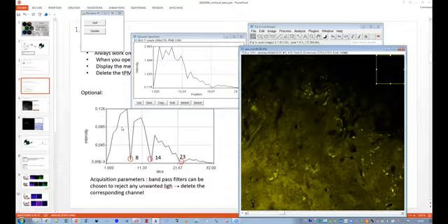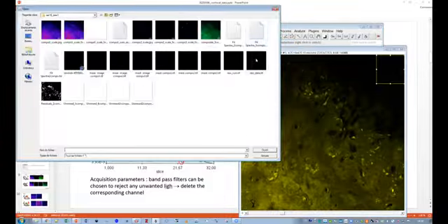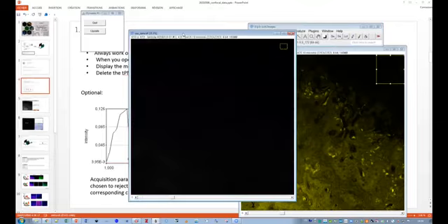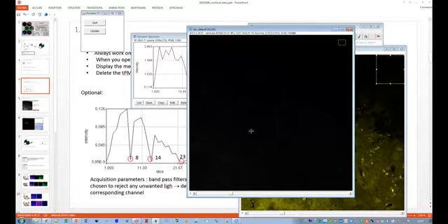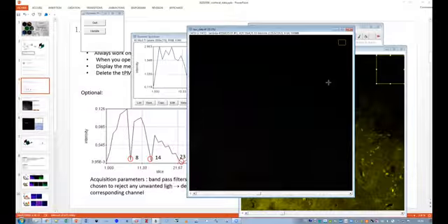Because they correspond to excitation lines. Okay, that's to filter out the laser lines. This is the first filter, the first light, and you see it's black, so I delete them. The excitation lines are suppressed on the microscope by filters, and that's the reason why you get those dark images. Yeah, exactly. Perfect.